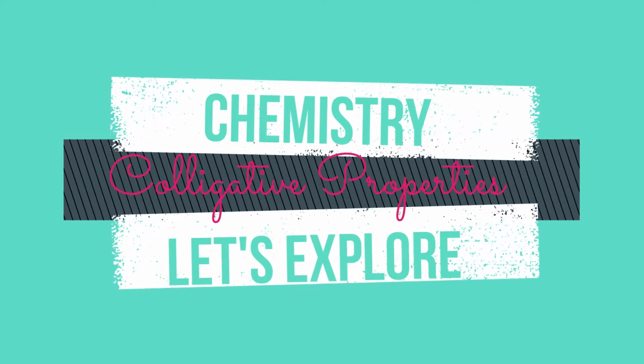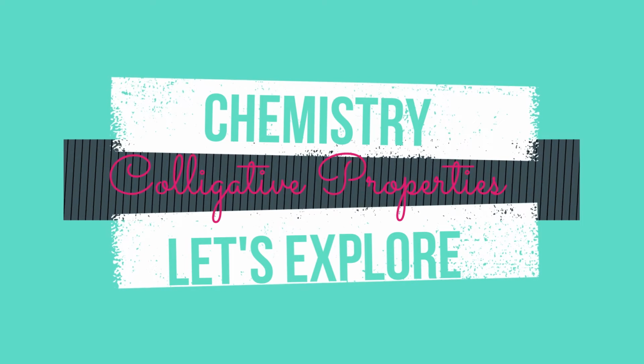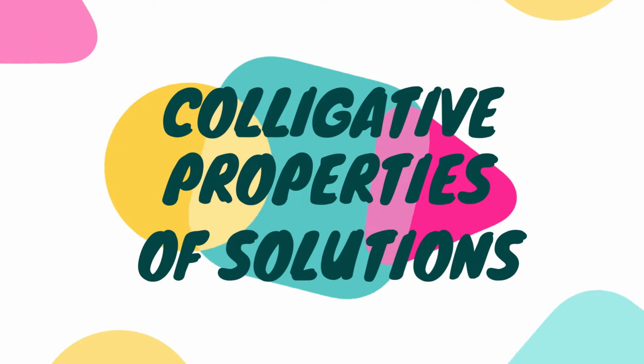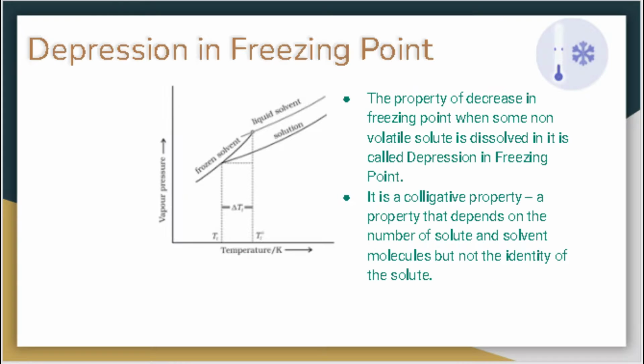From the 12th grade of Kamal Model Senior Secondary School, I, Pragati, along with my friends Medha, Bhaskar, and Kunal, am going to explore some super interesting colligative properties of solutions. So let's understand the first property, which is depression in freezing point, with the help of an experiment.